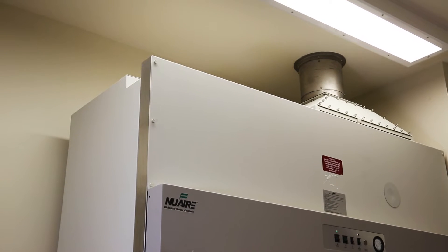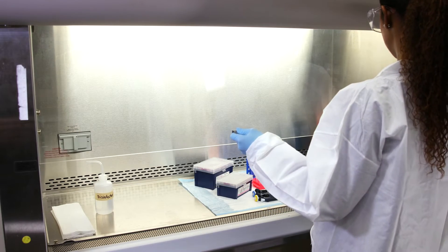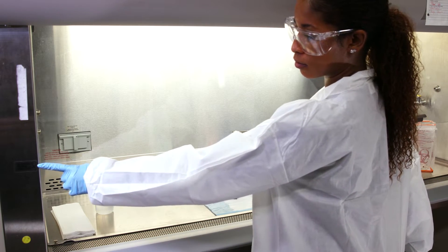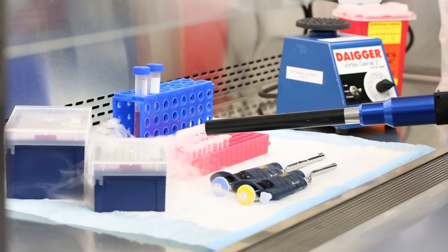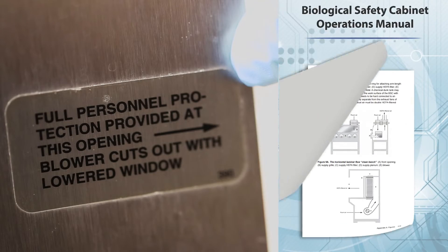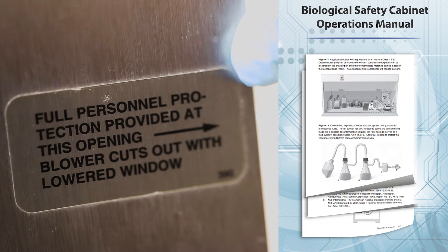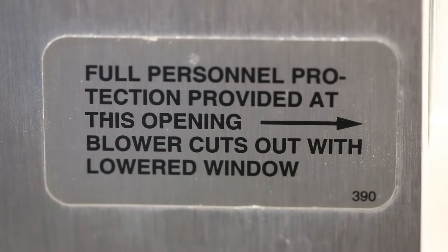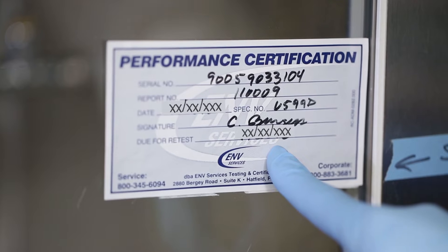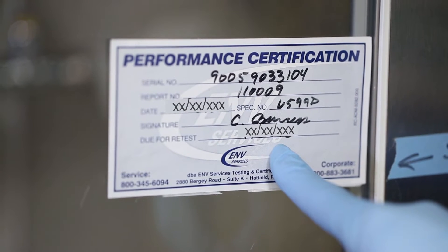Placing a BSC too close to an HVAC supply vent can also interfere with the BSC containment. Proper sash height is critical because when the sash is kept at the proper height, the appropriate inward air flow can be maintained. The proper sash height is designated in the BSC operation manual and should be clearly indicated on the BSC. The performance of the BSC at the declared sash height is actually part of the cabinet certification process.